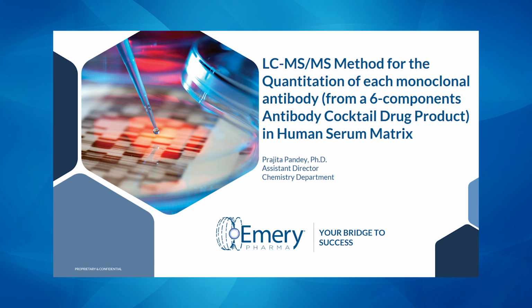Today I'm here to discuss LC-MS method development to quantitate each antibody from a 6-antibody cocktail in human serum. Traditionally, this kind of work is done using ELISA, which would require 6 independent ELISA assays. But I'm here to present today some advantages of using LC-MS for this kind of workflow and also walk you through a stepwise approach to get a single workflow.